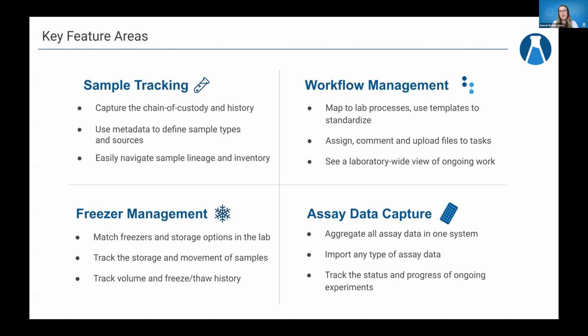And then, of course, freezer management, being able to track that storage of samples within the lab. All the things that you would expect out of a freezer management tool. You can match the freezers and the storage options in your lab with the digital options that we provide. It's very flexible, customizable there. And then also sort of tracking that movement of samples, both in and out of storage, but within storage as well.